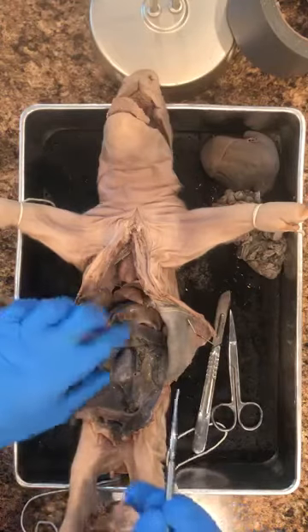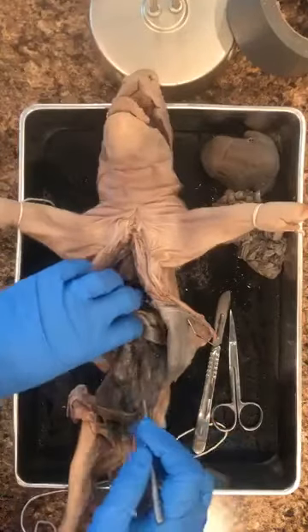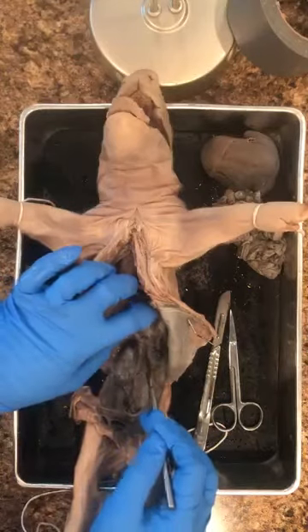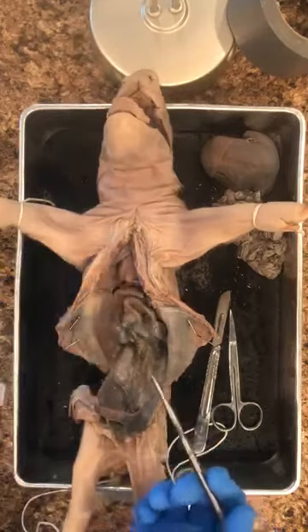Right beneath the stomach, there was the pancreas, which I usually have a really hard time finding, but I ripped part of it. Here's the pancreas. It's this weird textured organ right here. I'll show you a picture of that as well.